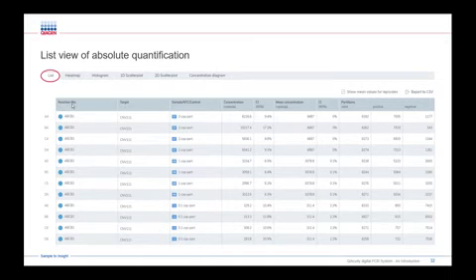Of course, it will do so only if you have defined it previously. There's no need to do so, but I can tell you it's quite helpful. Then the next column will contain the target or channel, depending on the settings defined when selecting a source. This column shows then the target or channel names.